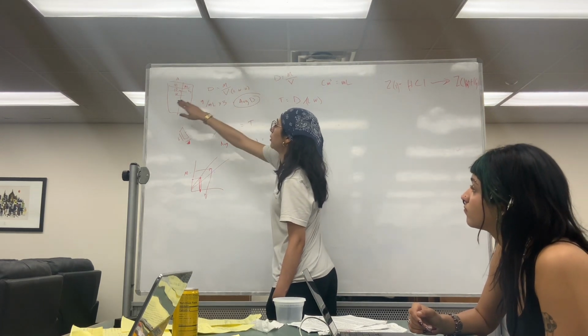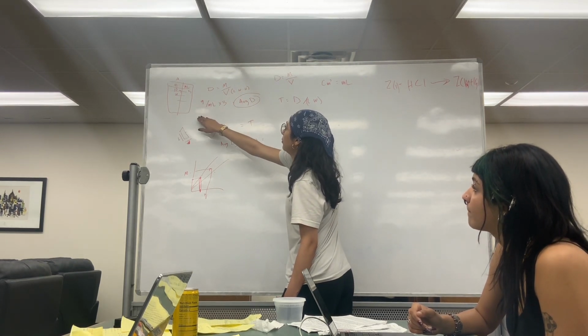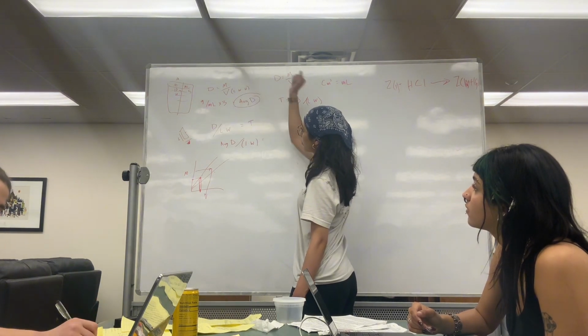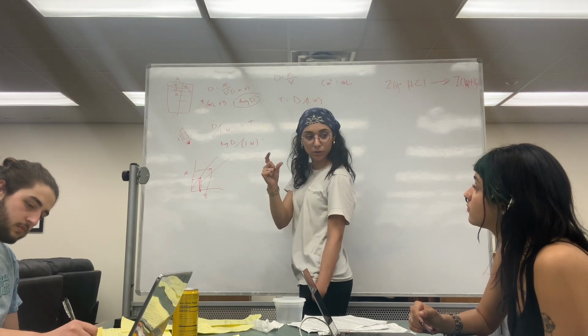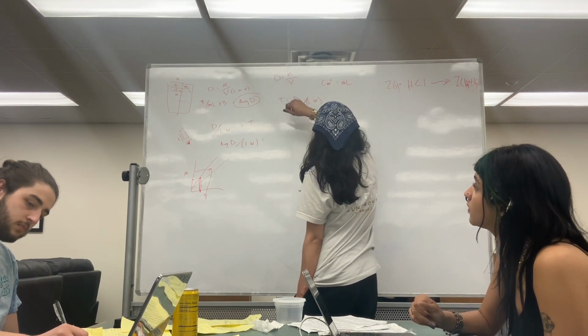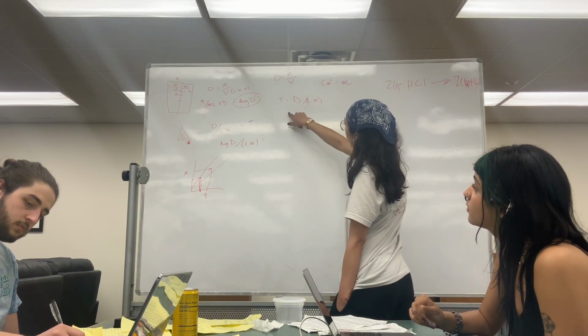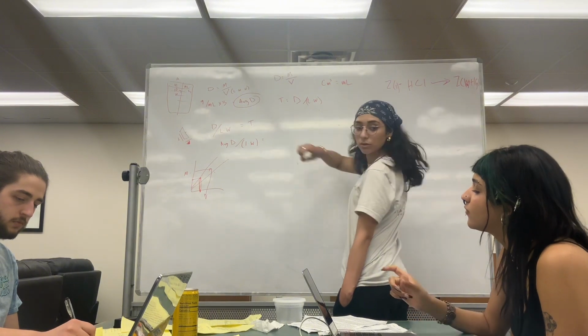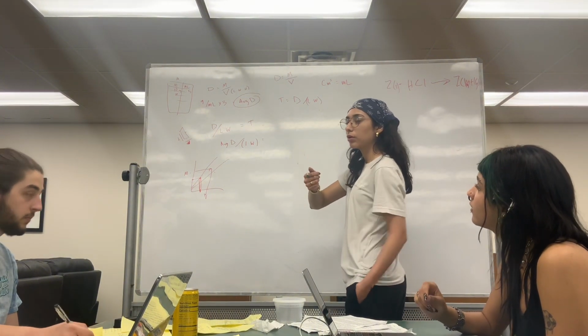So it'd just be mass divided by volume. The volume is just length times width times height of the aluminum rod. Then after that, we take that equation to find the thickness of the aluminum. They give you a sheet of aluminum, a thin sheet. Yeah, the sheet.